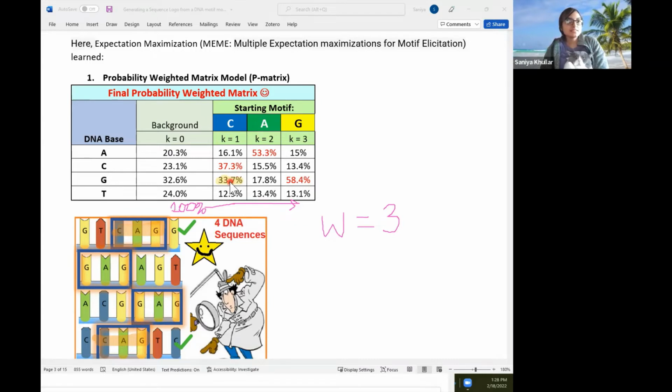So what we do next is we look and we see, oh, it turns out we can see a GAG here and a GAG here in the second and third sequences. They may not be the optimal CAG, but in fact, they're the runner-up, because what GAG would do is it would stitch together this and this.